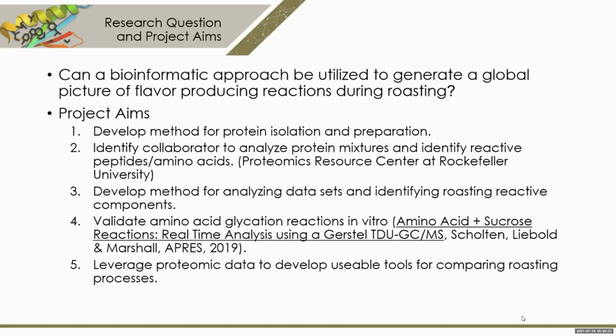This made us ask the question, can a bioinformatic approach be utilized to generate a global picture of flavor-producing reactions during roasting? In order to do this, we needed a method to prepare samples for proteomic analysis, a collaborating lab to run the samples, and methods to analyze the data and compare data sets. Developing the method would allow us to compare roasting processes and variables in flavor production.